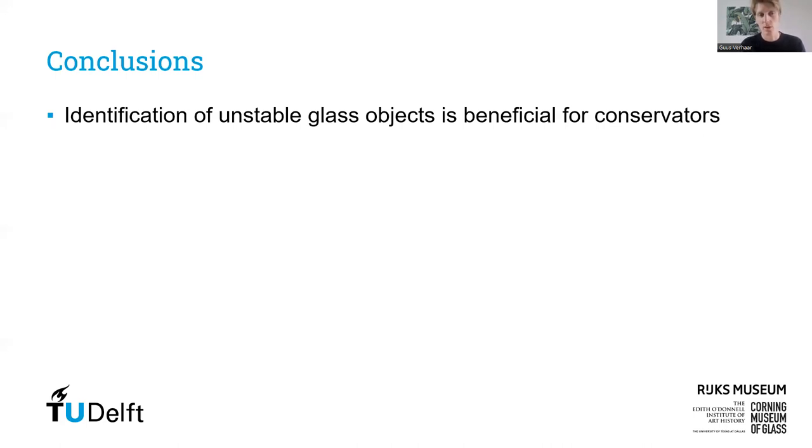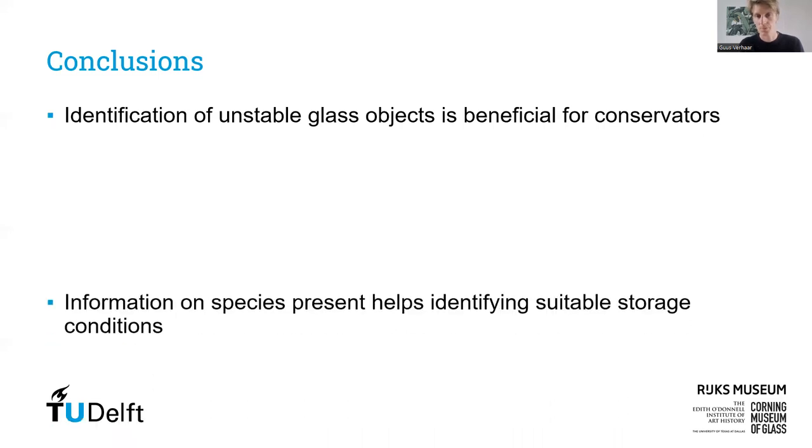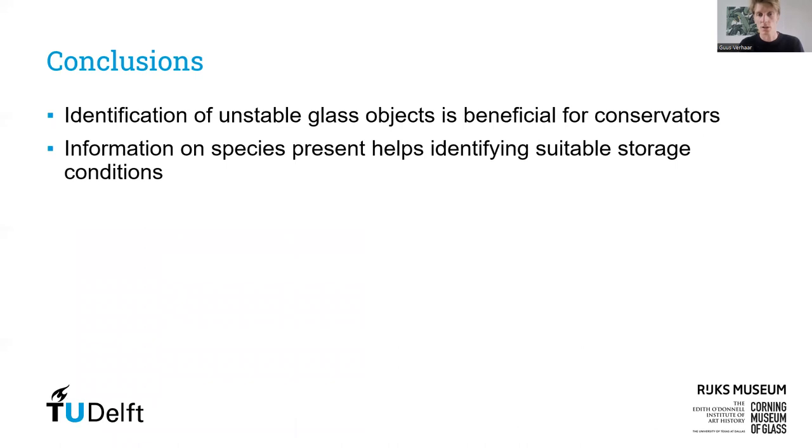Procedures like the water drop method not only provide us with tools to identify unstable glass in museum collections, they also give us insight into the subtleties of glass degradation and help us understand why we observe particular degradation patterns on museum objects. The identification of ionic species present on glass surfaces is an important factor in the identification of suitable storage conditions. They determine the point at which water may be attracted to the glass surface, which would increase glass degradation. This information could be used to develop guidelines for the safe storage of unstable glass.